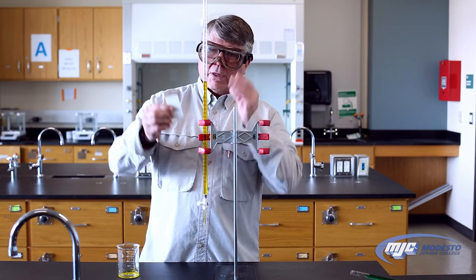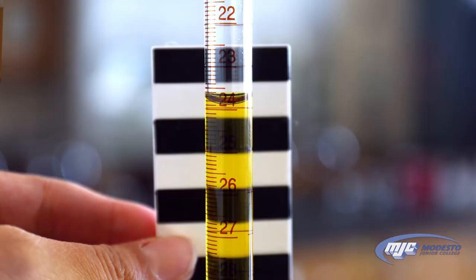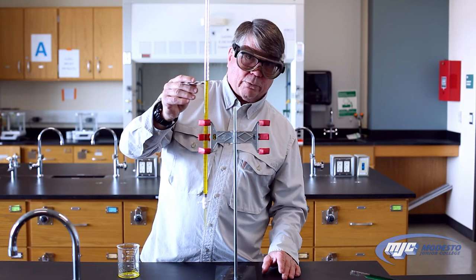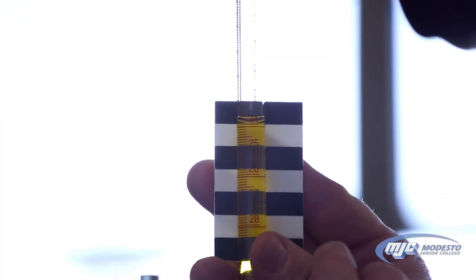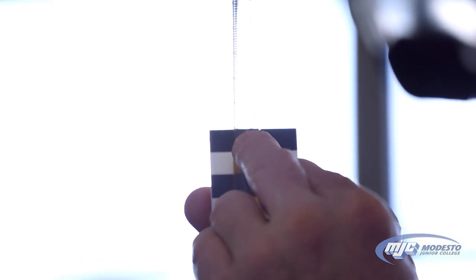To read this volume, take your contrast card and hold it up behind the burette. Read the bottom of the meniscus. In this particular case, the meniscus is between 23 and 24 — the volume increases going down, so it's between 23 and 24, meaning it's 23 point something. It's just beneath the 23.8 mark, so we need to determine those last two decimal places.